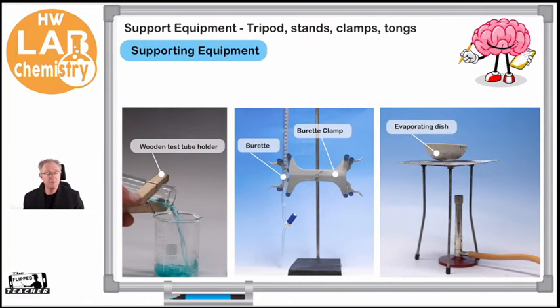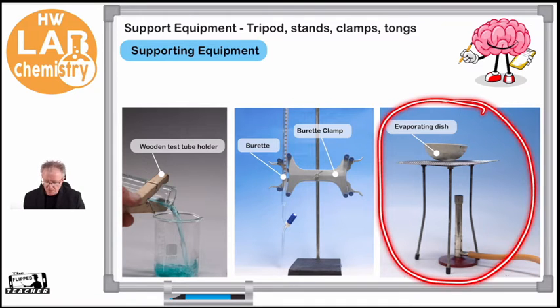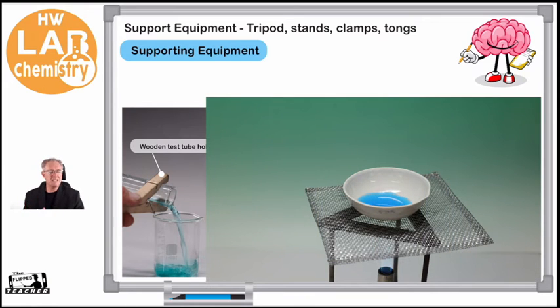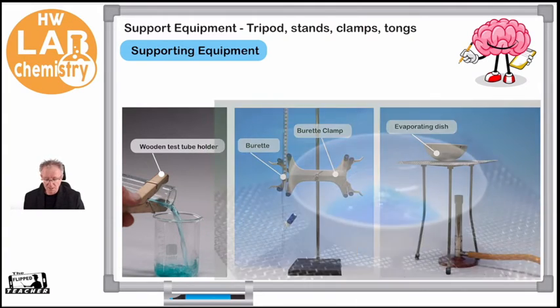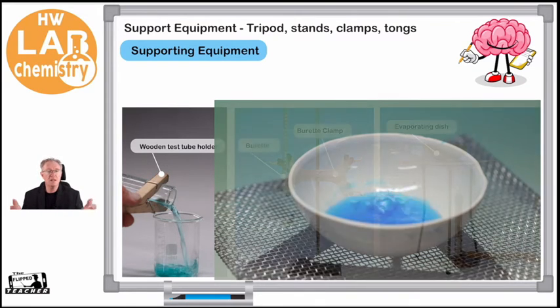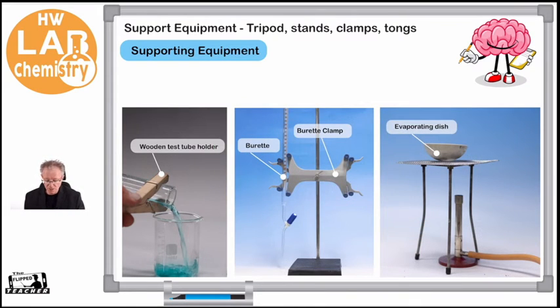Here's a closeup of some other pieces of equipment. We've mentioned the tripod, but we also have a wire gauze. In this particular experimental setup, we're doing evaporation — a separation technique we'll look at in another video. We have an evaporation dish we need to hold in place because it contains liquid that we want to heat. We place the dish on top of the wire gauze, and the wire gauze functions to spread the heat out evenly.